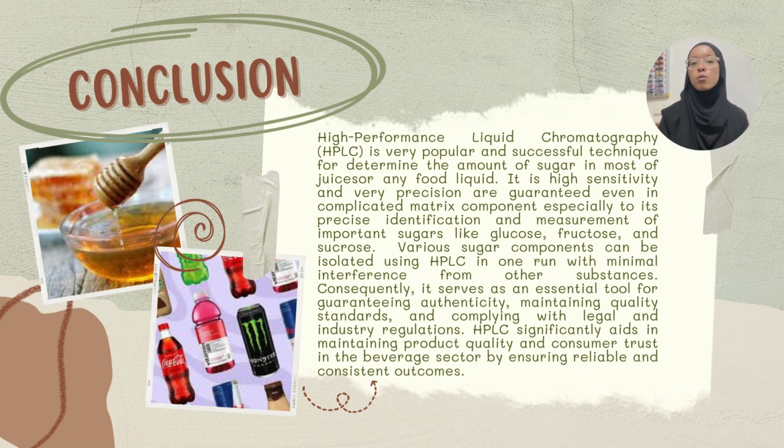One of the key advantages of HPLC is its ability to isolate various sugar components in a single run. This minimizes interference from other substances, ensuring that the results are both accurate and reliable.